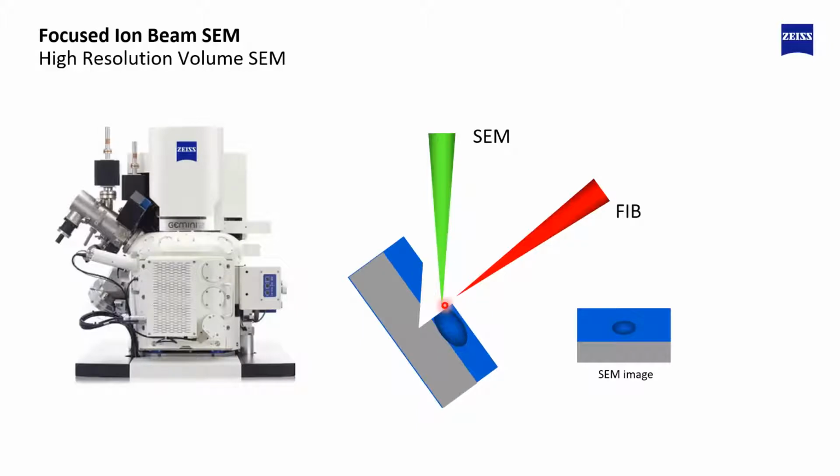So what we do first is we are trenching into the surface and creating a new perpendicular block face, right? So originally the block face was the long edge here, but now with the focused ion beam, we are generating a trench, and this side wall here is what we are imaging. So the scanning electron microscope comes and scans over that block face on the side and creates an image like that with a cross-section going through this ellipsoid volume of interest.